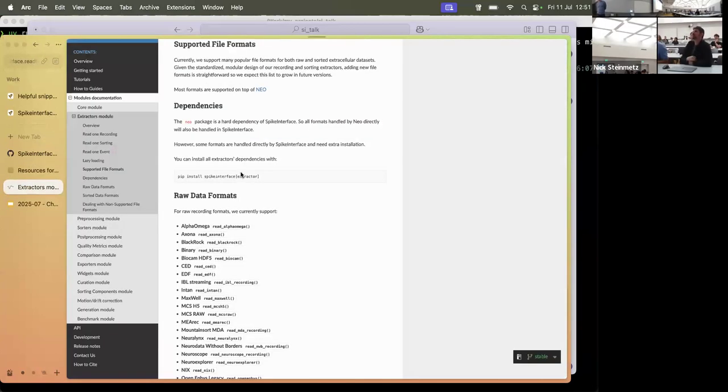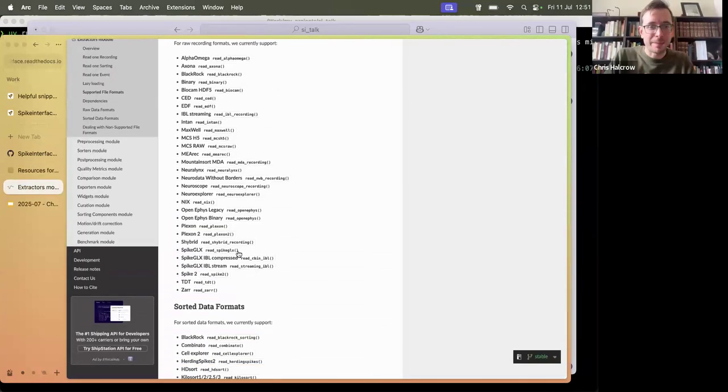I don't know exactly. I'm not an expert. Supposedly, we do support some Plexon formats, but as you're saying, these formats change over time, and it can be that it doesn't work. The actual thing that deals with all these formats is a package called Python Neo, which has quite a lot of crossover between the developers.